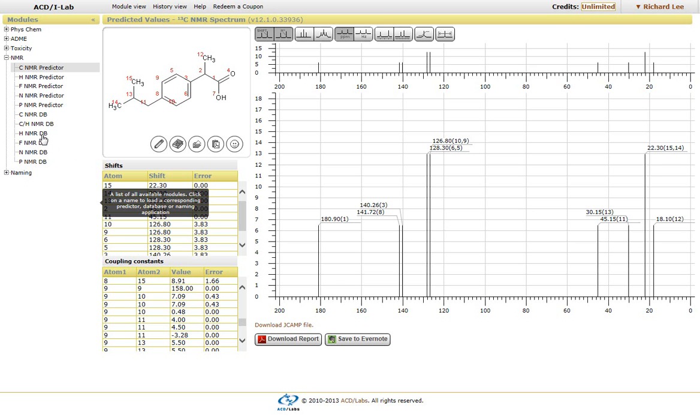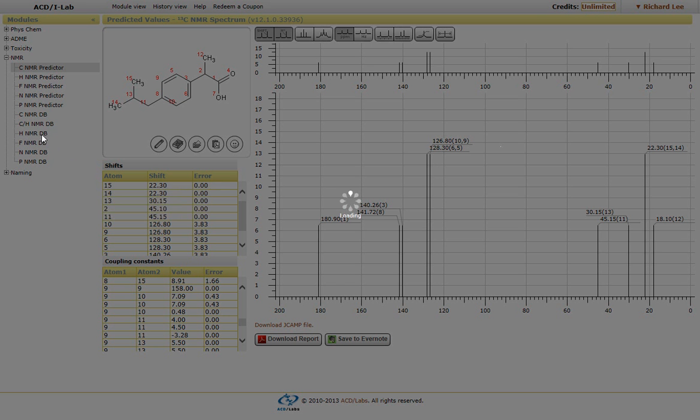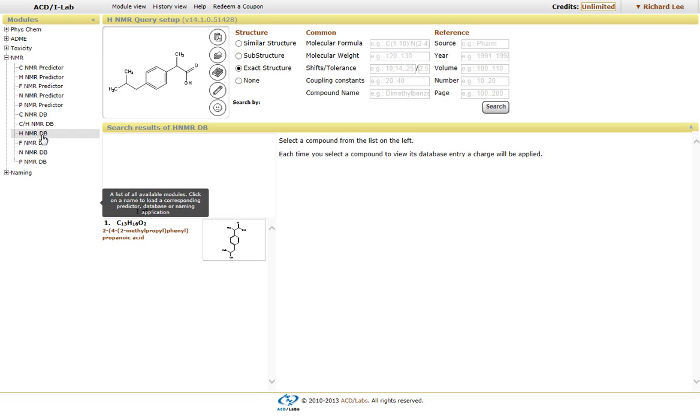So if we click on the proton NMR database, you'll be brought into this window.